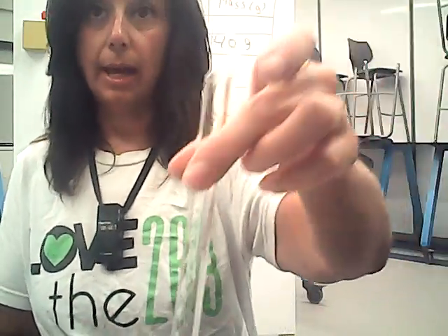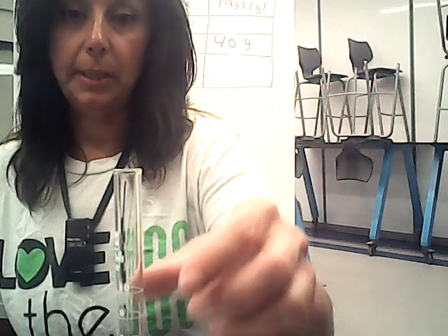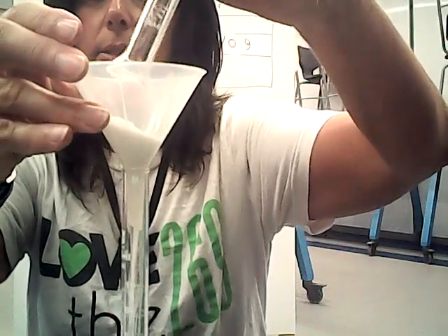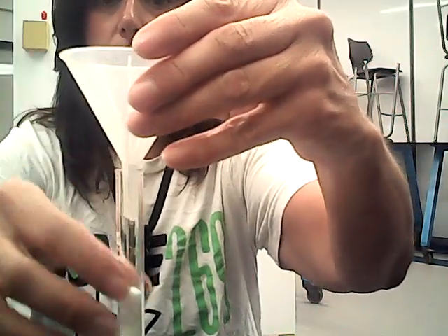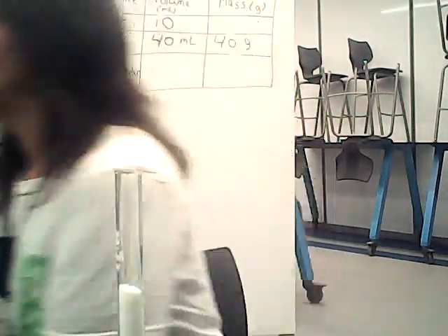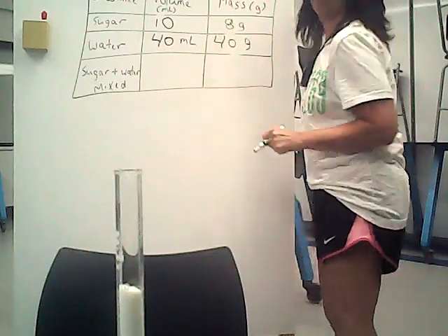We're going to do the same thing with the sugar. We'll set it and add the graduated cylinder. We'll tell it to minus out how much the graduated cylinder was, which is 26 grams. Now I'm going to carefully pour the sugar into this graduated cylinder. Let it all settle in there. It is 8 grams of sugar.